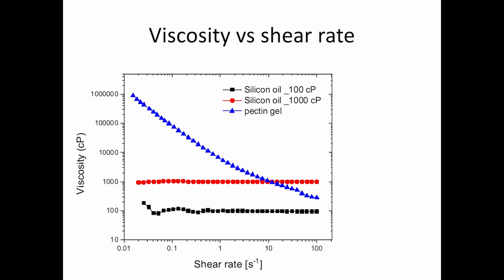One thing to notice is also that for the low viscosity sample, at low strain rate, the viscosity value does not seem to be so constant, and that's again expected, because at very low strain rates the torques required are extremely low, and sometimes we may be at the instrument limit.